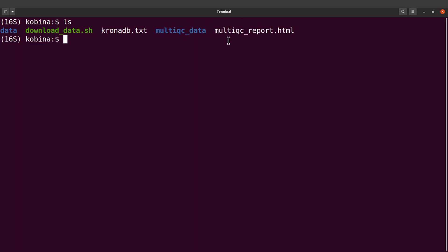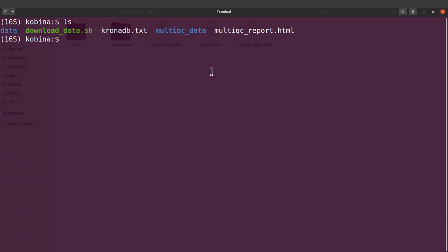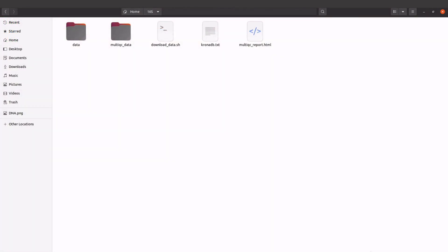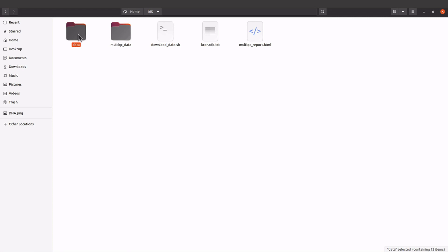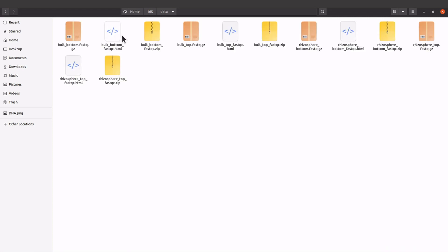This has all the reports, so let's open it in the browser. Okay, so this is the multiqc report. If you want to check the individual reports, you can find them in the data directory here.